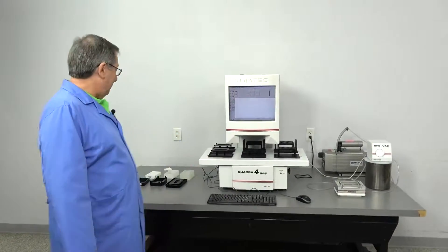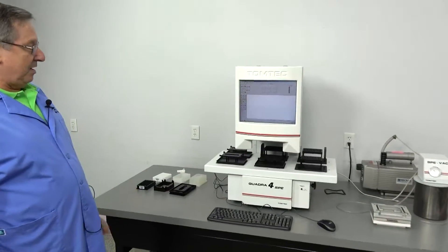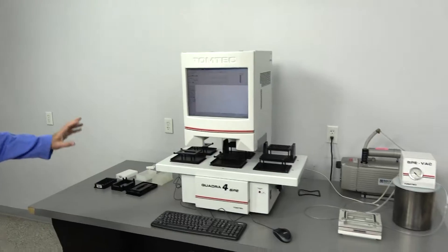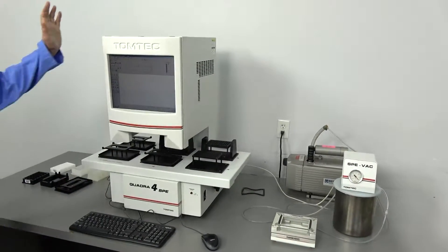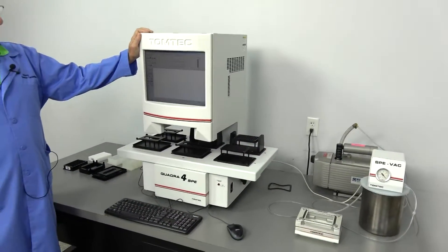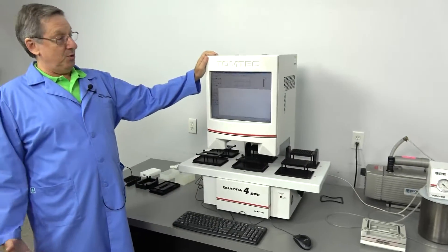Not important, just ask for the TomTek. This unit is a newer unit built sometime after 2012. Comes with Windows embedded and an i5 processor, so it's reasonably fast.